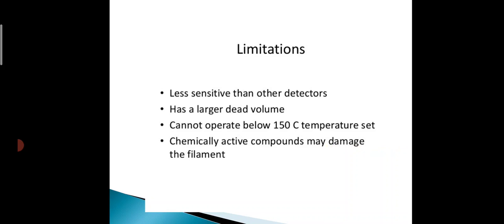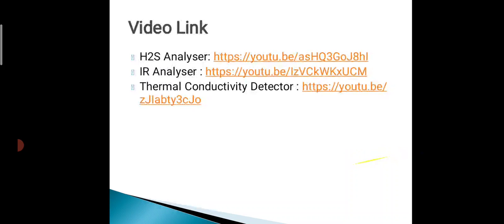Limitations: it is less sensitive than other detectors, has a larger dead volume, cannot operate below 150 degrees Celsius temperature set, and chemically active components may damage the filament. These are the limitations of this thermal conductivity detector.